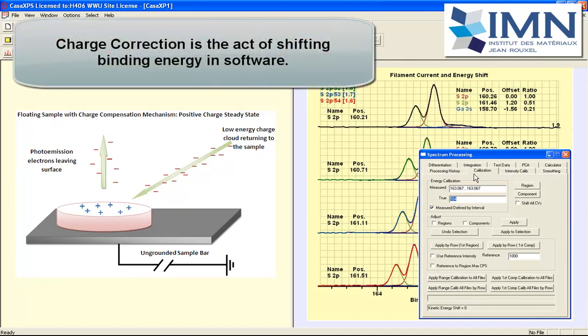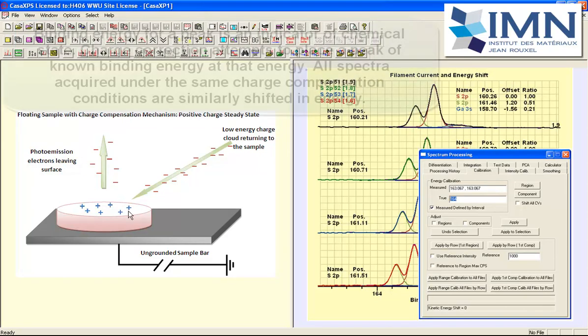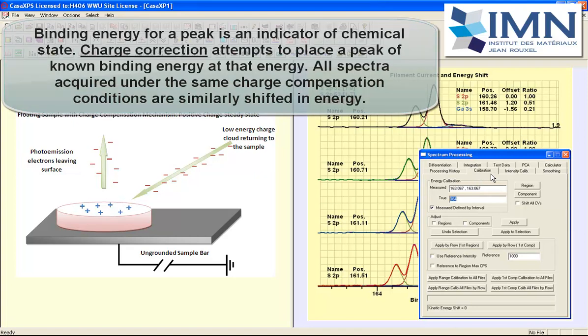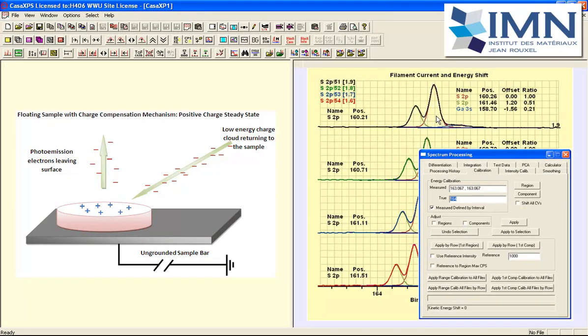In order to do an analysis for data such as these the software needs to be able to do charge correction. That is to say we need to shift peaks a known amount that is representative of the charge state that was established for the surface by the charge compensation. This video is going to look at the calibration property page of CASA XPS and how these features are used to charge correct spectra so an analysis can proceed.